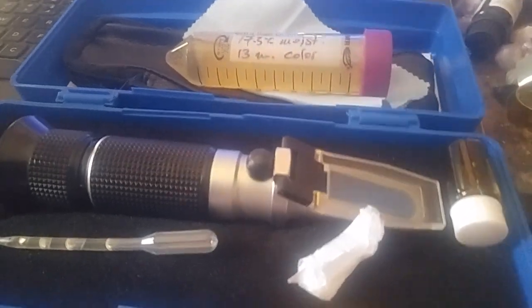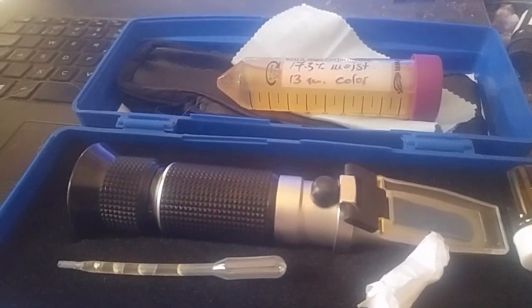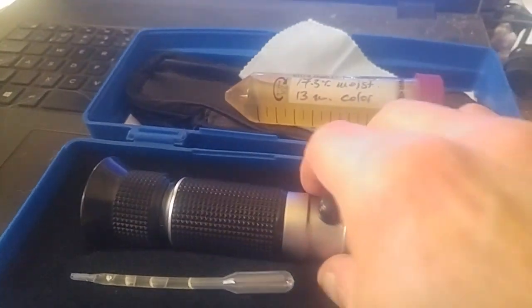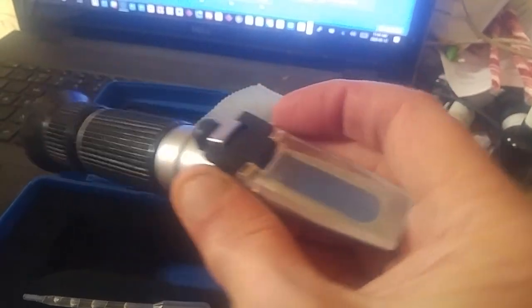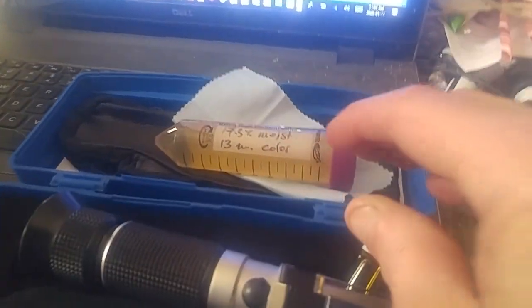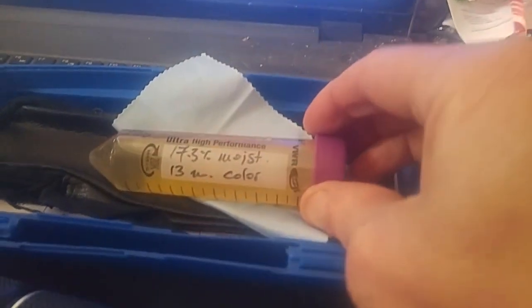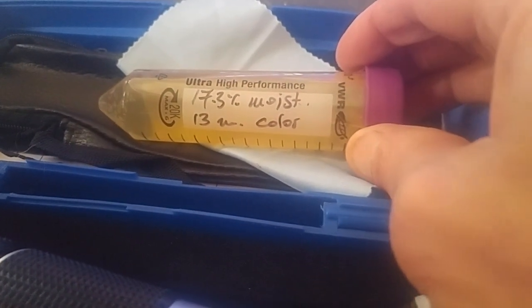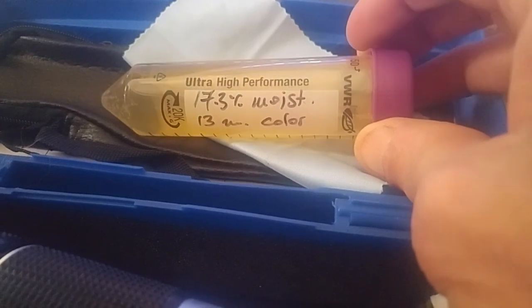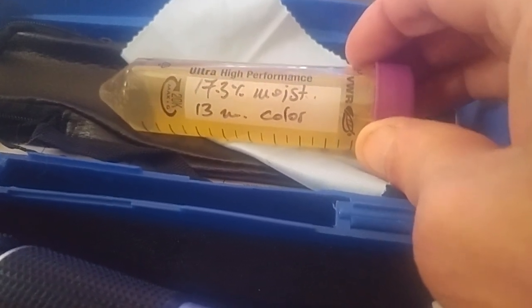Good day y'all. Today's video is on a new toy that I got — it's a refractometer. It tests the percentage of water in honey. They send you a sample and this is to calibrate it. The moisture content of this honey is 17.3.